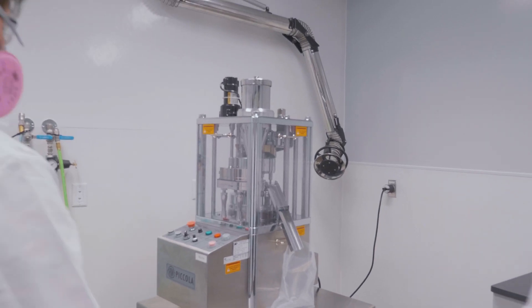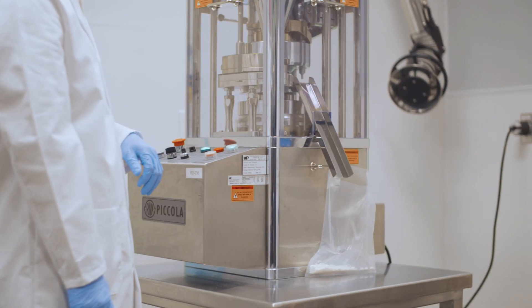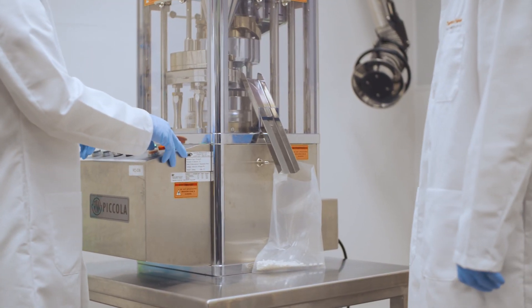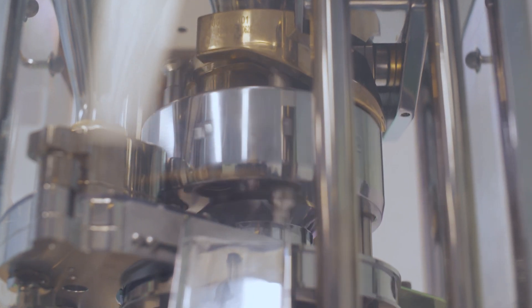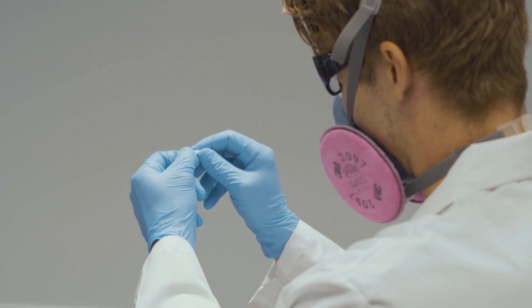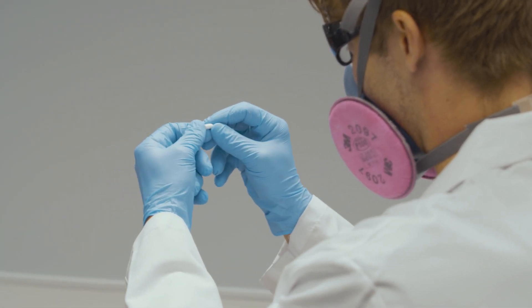The site also manufactures tablets and capsules by converting the intermediate into a formulated dosage form. The site has both R&D equipment like the Picola R&D press, which is a 10-station press, and we scale up to the GMP side of things, which has a Korsch XL 100, which is capable of doing 50,000 tablets an hour.